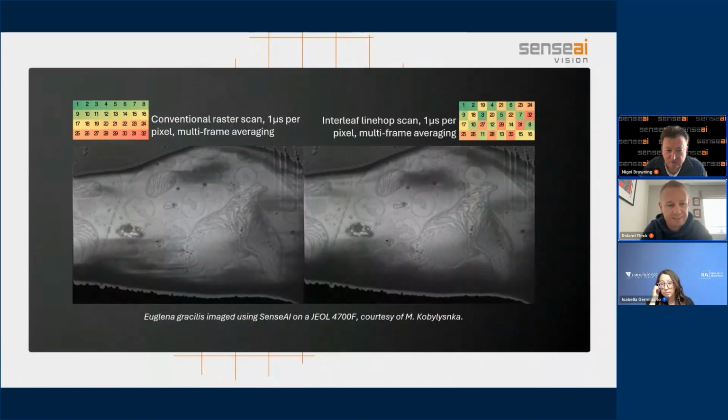Here we go. Perfect. Okay, so this is a Euglena gracilis. It's a flagellate euglenoid. This is vitrified, so this is unstained. It was living and swimming at the point of vitrification. I have actually frozen them and brought them back to life again. So in principle, this is a fully viable cell.